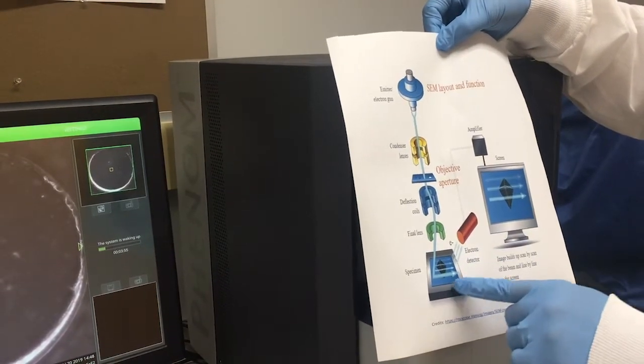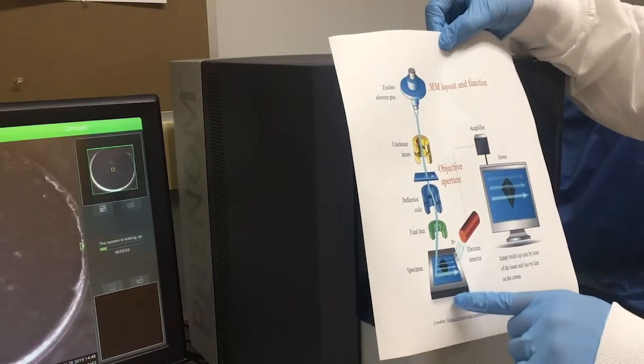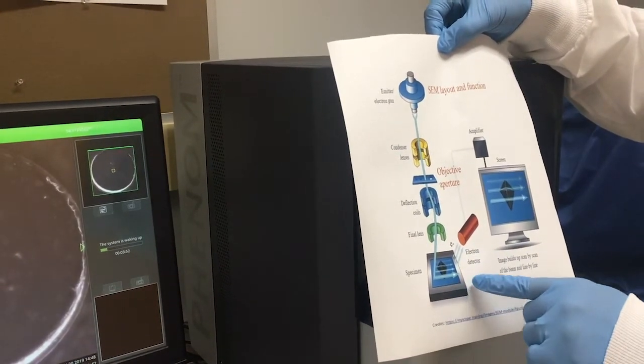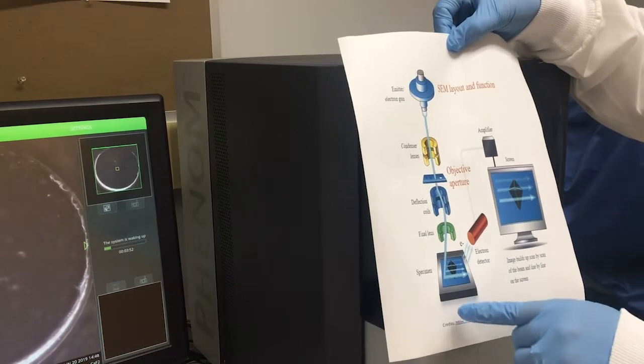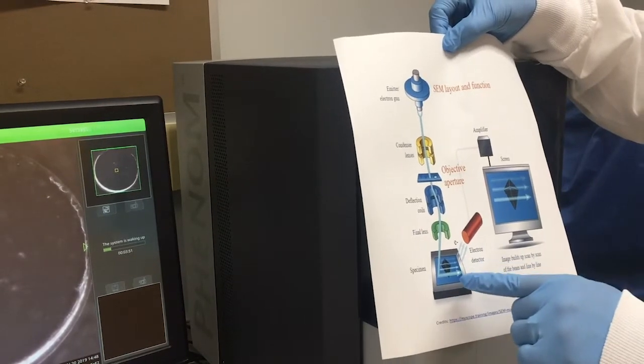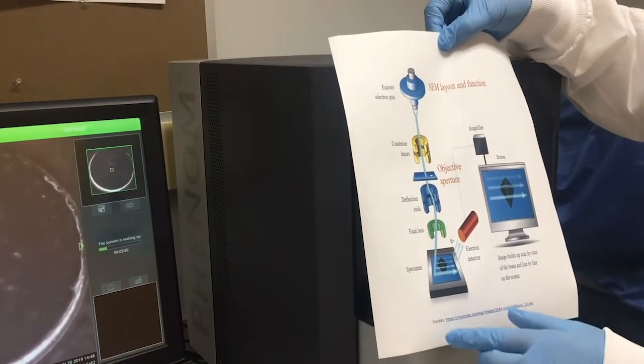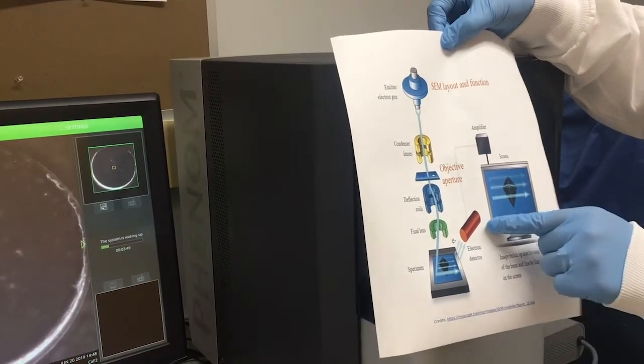Backscattered and secondary electrons are usually used for SEM imaging. The image is then projected on the monitor.